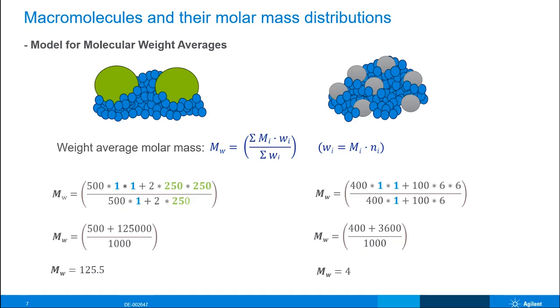And the big takeaway here is that having just a few large outliers and a much less narrowly distributed sample will lead to a gigantic influence in raising the MW of the sample that's being looked at. And from here, what we can do is find a way to describe how these are distributed, which we'll talk about more in the next slide.